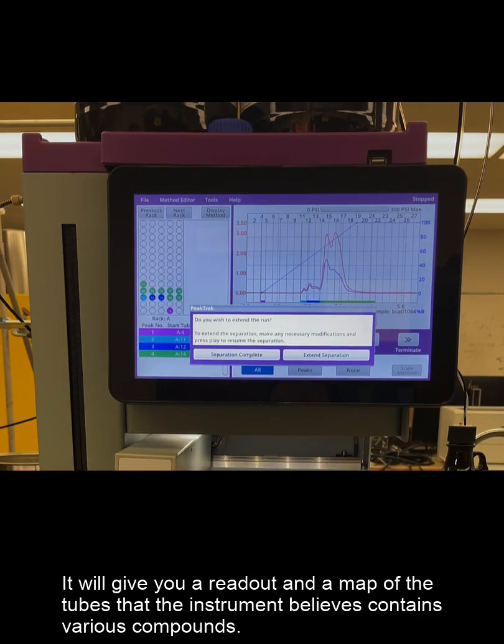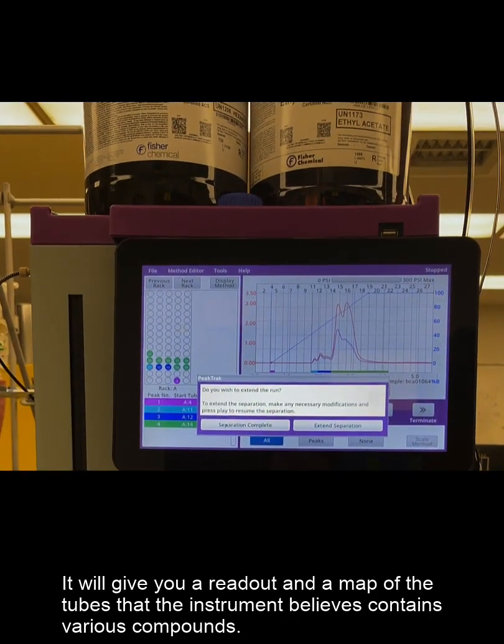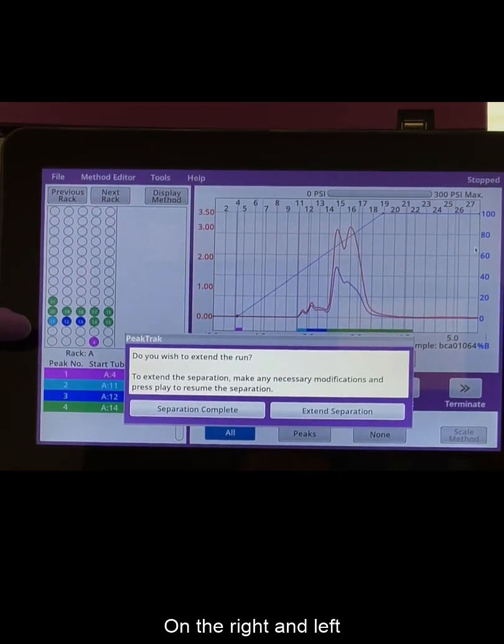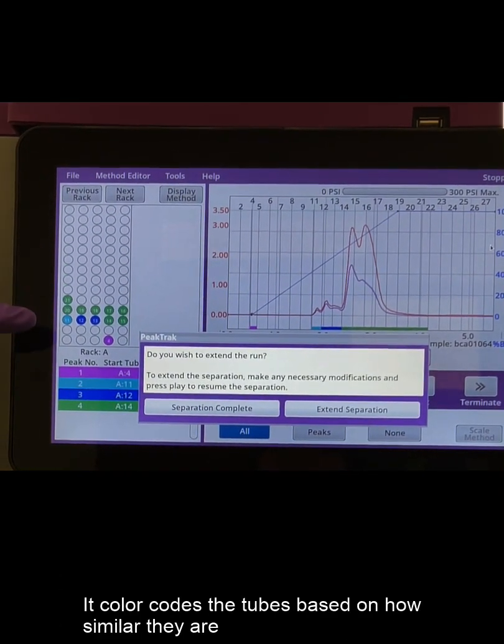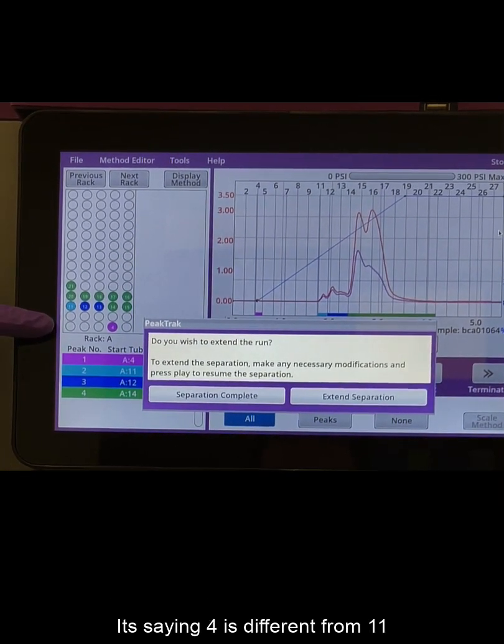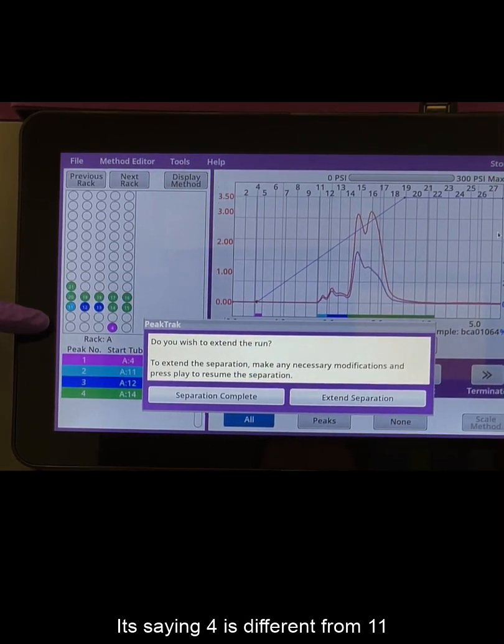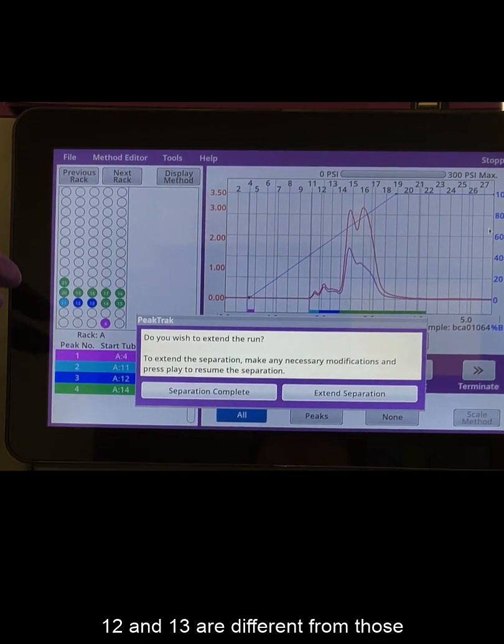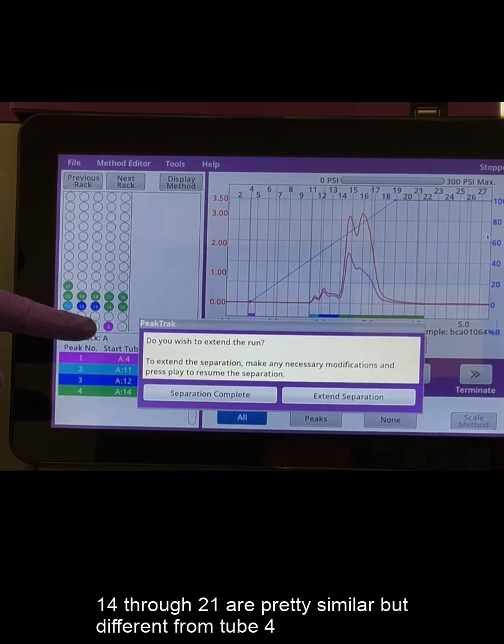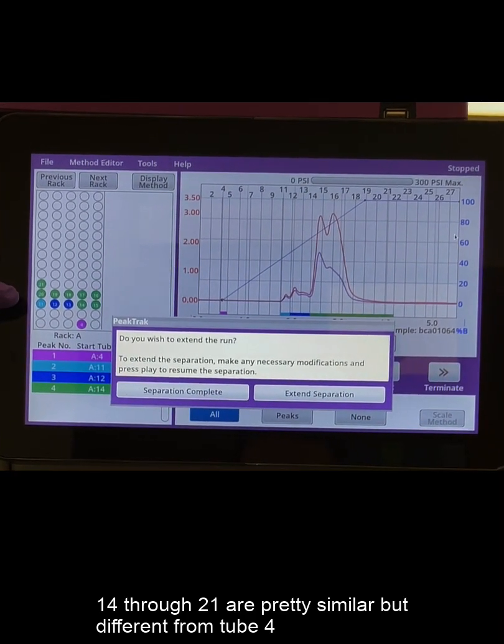It would give you a readout and a map of the tubes that the instrument believes contains various compounds on the right and the left. It also color codes the tubes depending on how similar it believes the solutions are. So it's saying tube 4 is different from 11, and 12 and 13 are different from those, and 14 through 21 would all be pretty similar and different from tube 4.